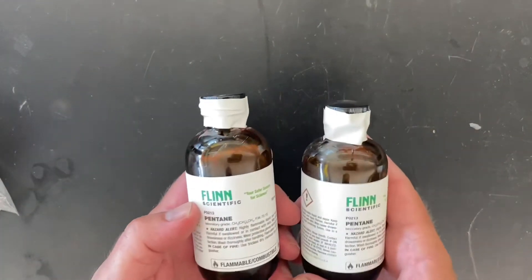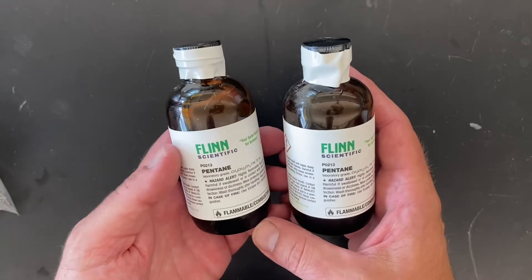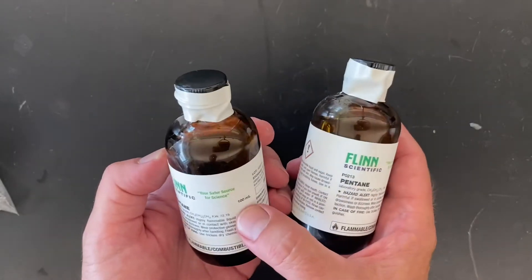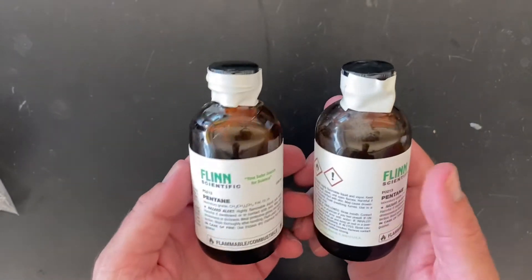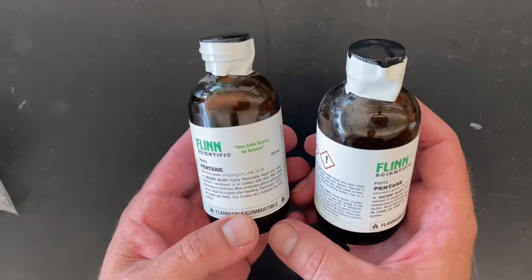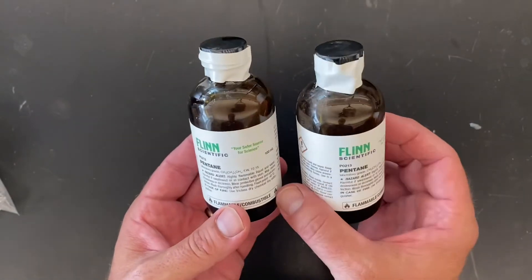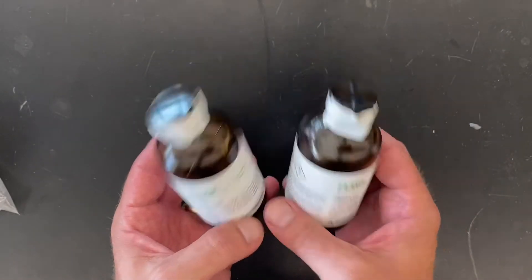After removing the bubble wrap, we have these two bottles of pentane — 100 milliliters each. Pentane is a liquid you can see in these brown bottles. It's a hydrocarbon made of five carbon chains and happens to be a liquid at room temperature. So these are simple hydrocarbons.